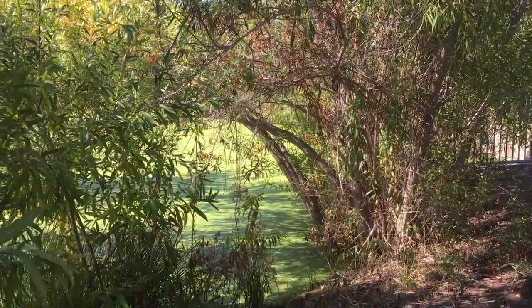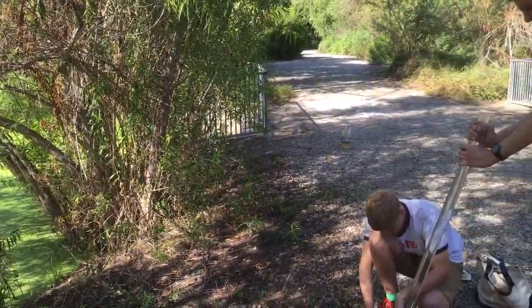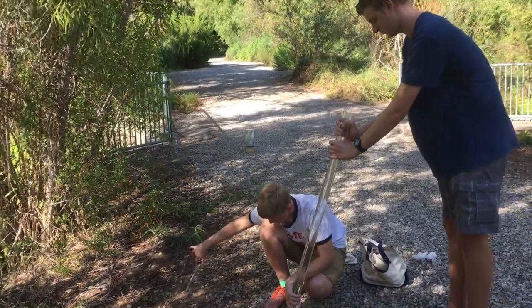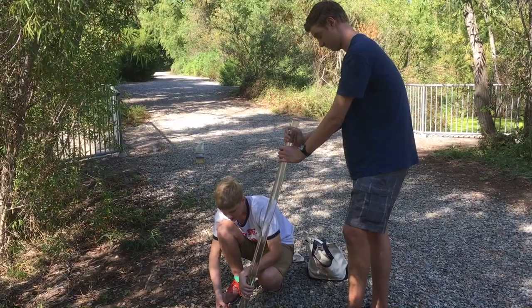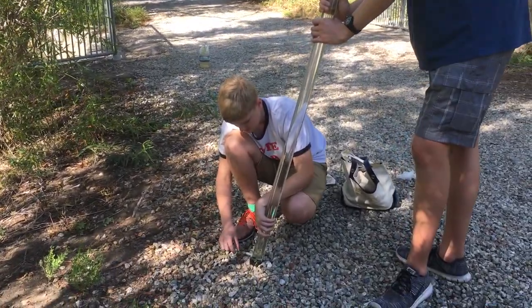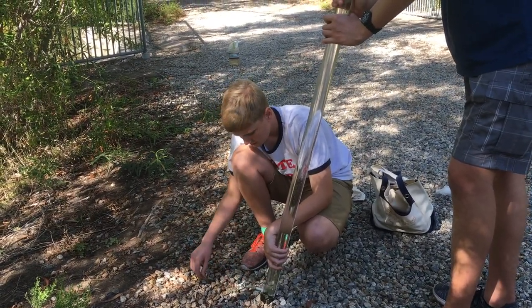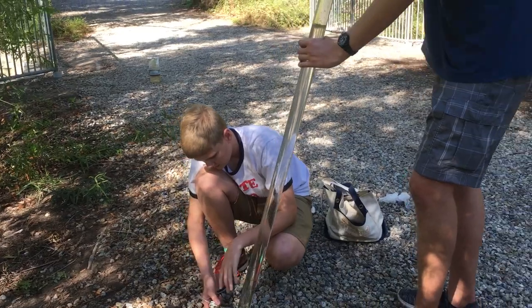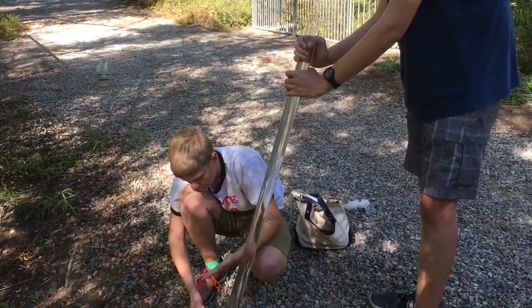Here we are at the duckweed pond and we're going to show how turbidity is measured. We have a Secchi tube, which is a collection tube for rivers, creeks, and ponds. It is full of the duckweed water. The duckweed water has a lot of duckweed in it — we tried to not get duckweed in it, but that didn't work very well. The water is pretty clear already.